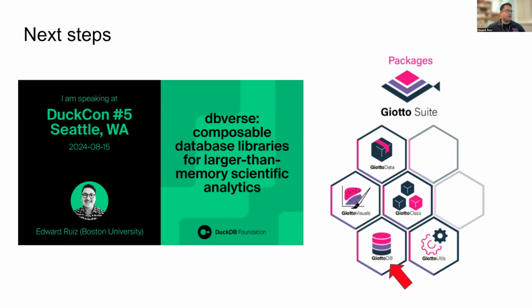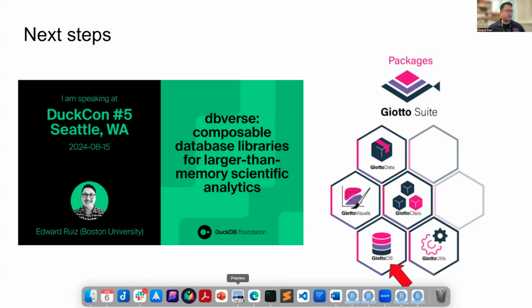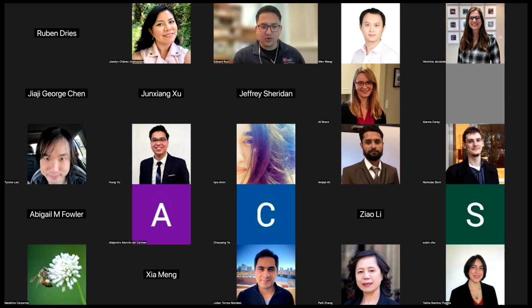But we also understand that these issues are applicable to a lot of people, not just those running Giotto, so we're trying to make sure that these packages are generalizable to other types of applications as well. So really excited to be able to release the code soon. The plan was to release it today, but unfortunately we aren't quite there yet, but still working towards it.